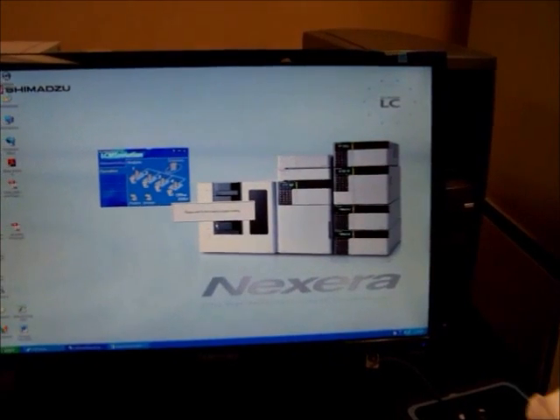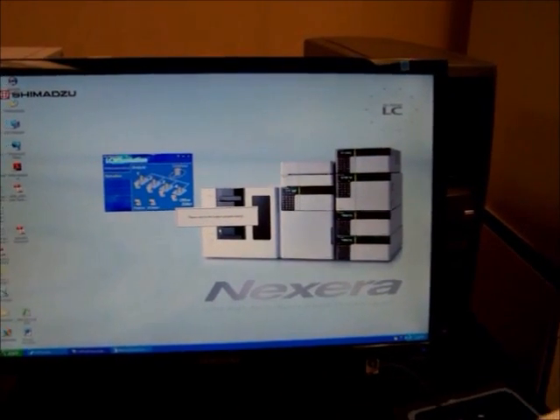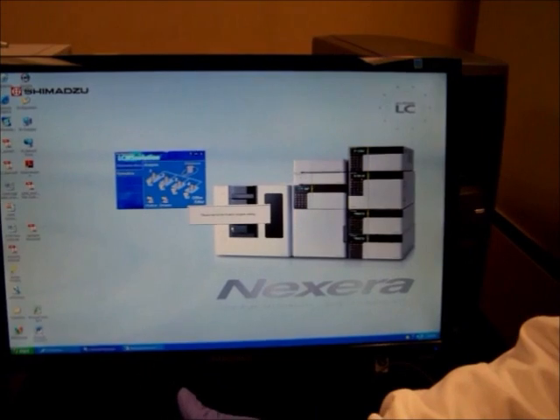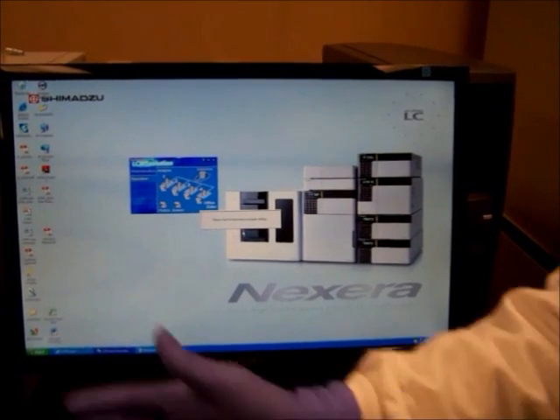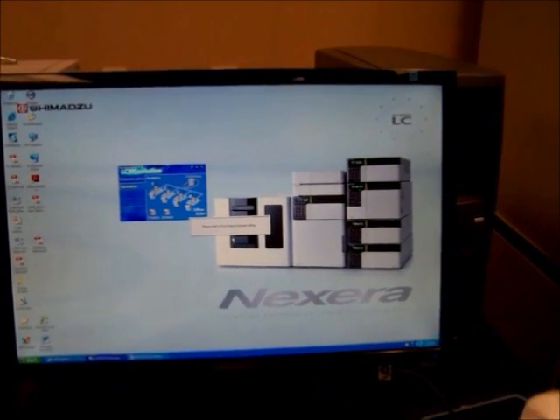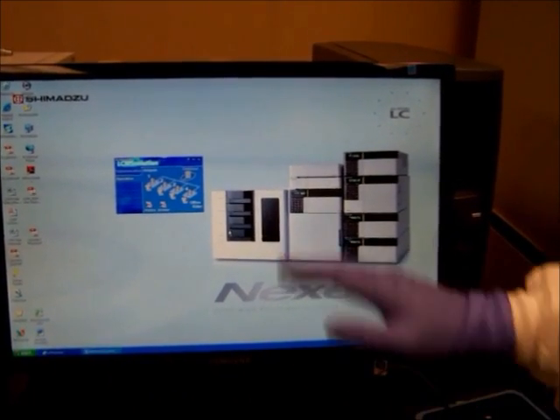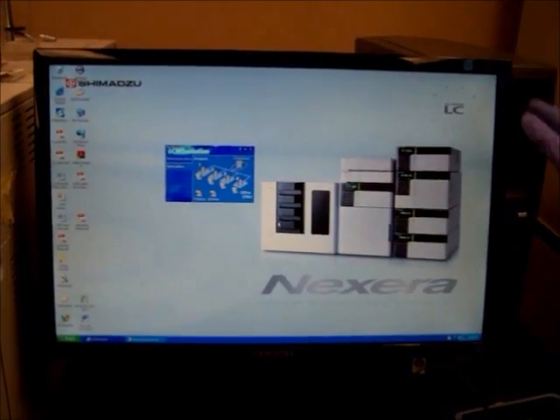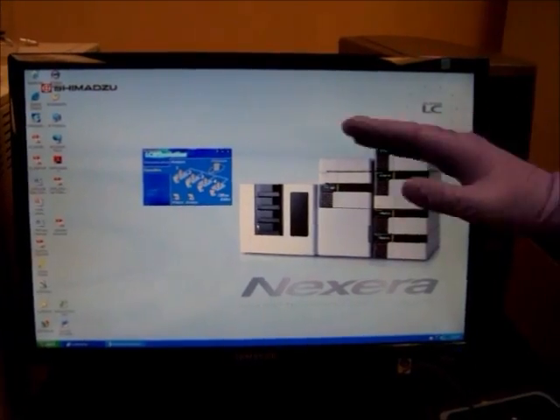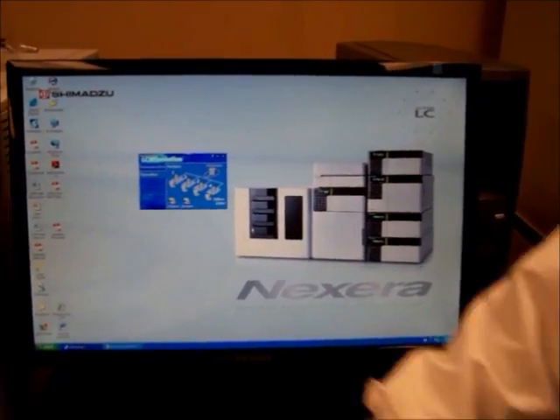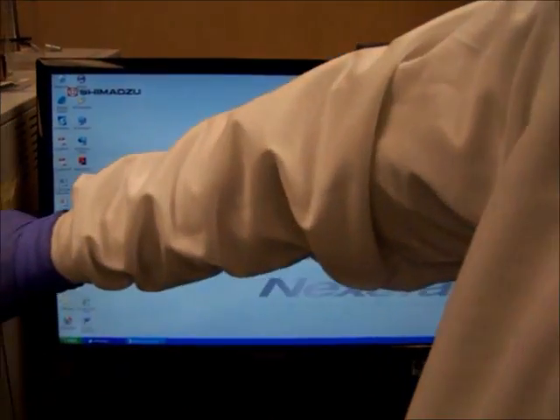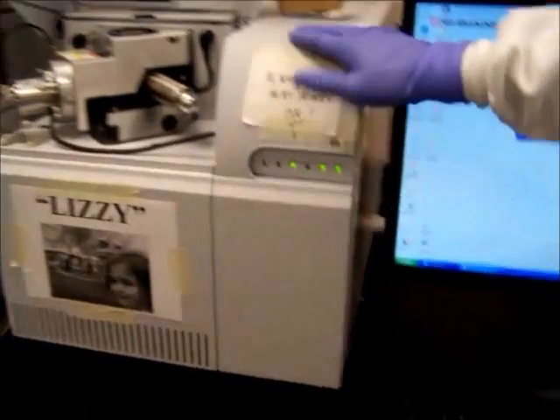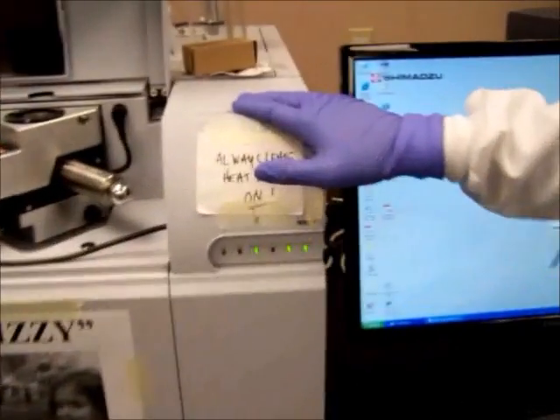Press OK. The machine will beep. There was the beep. It's disconnecting from the computer to the LC-MS. And make sure that the heater light is still on, meaning the heater is still running.